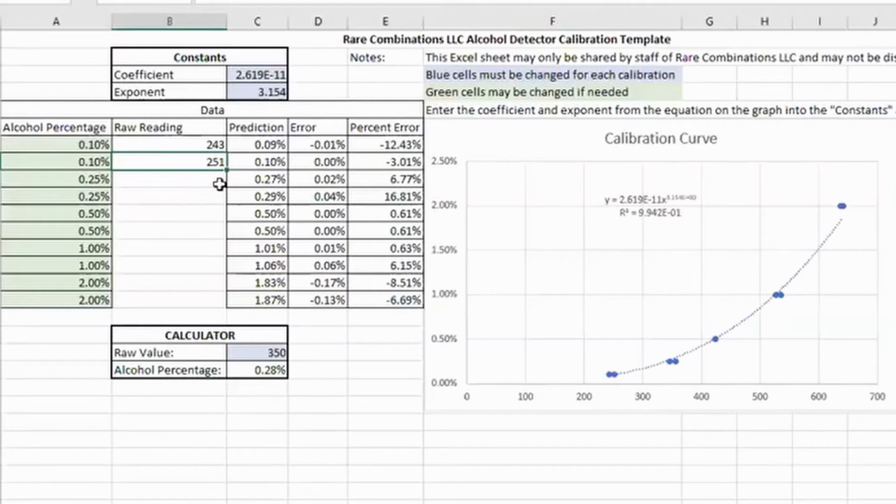There's also several other factors. If you screw in the tube properly, or if one sample was slightly warmer than the other. But the idea of using this method is that all of those inconsistencies will average out. So if you have a bias to say, oh, well, it should have been 243, but I got 251, then you may be adding some error into the estimation.